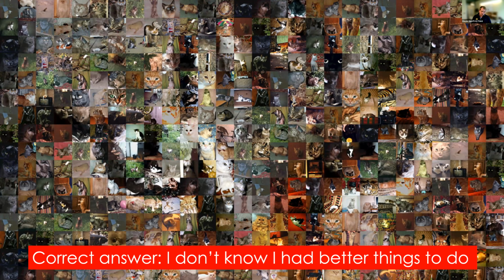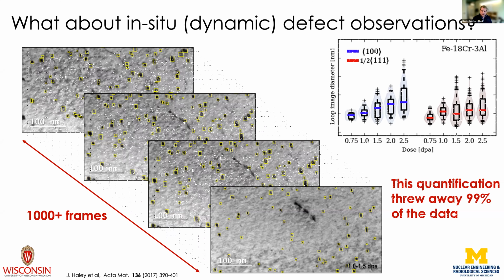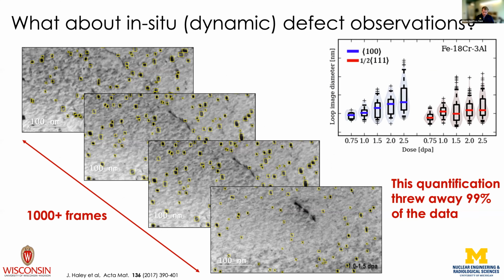But it's not an ideal situation. And also you would realize too that if I gave those videos to you guys to count, you all get different answers. And so how do you make a quantitative assessment across different research groups investigating similar materials or similar responses, which is so common today in collaborative environments, right? And so this becomes this problem with this 99% data throwout, right? We only looked at these 4 frames in order to generate that data, or 5 frames to generate that data.